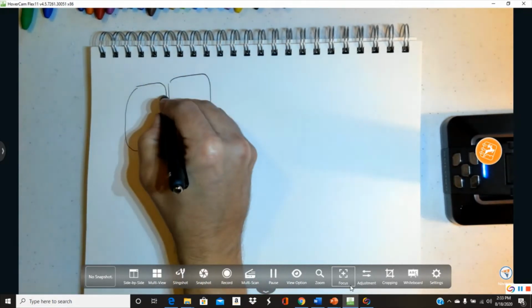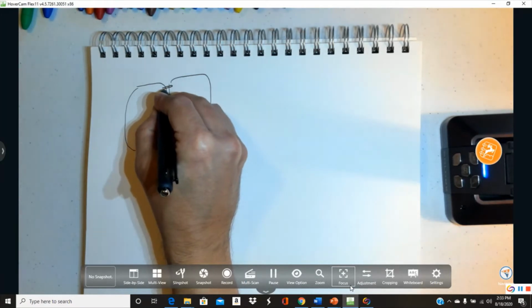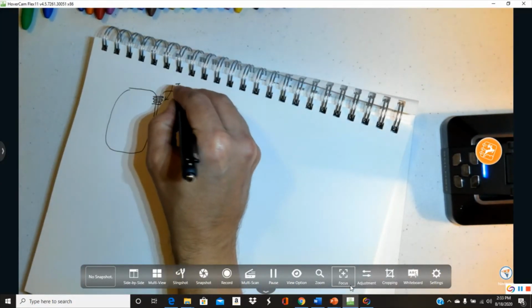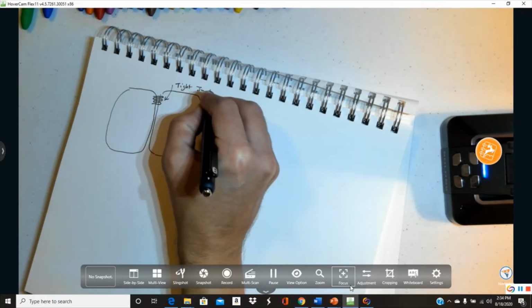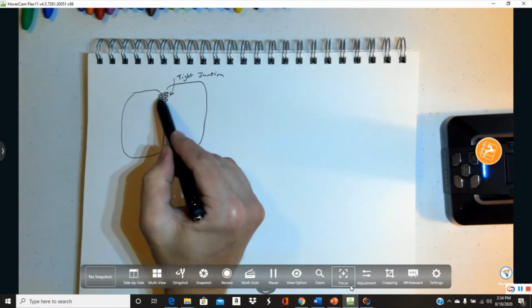One way is to go here at the very top, and at the very top, I can use a very tight knit bit of proteins that come together here. We can refer to those as tight junctions. And what tight junctions act to do is they are waterproof. They are found at the top of a tissue, usually like in the kidney or something.